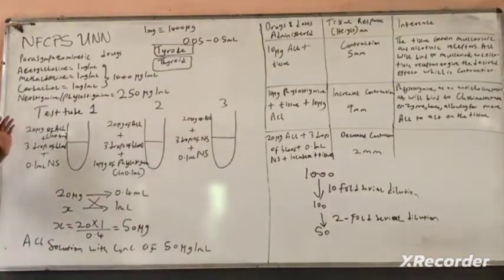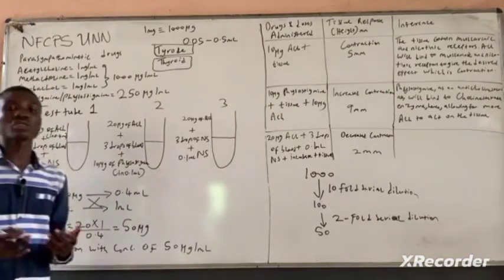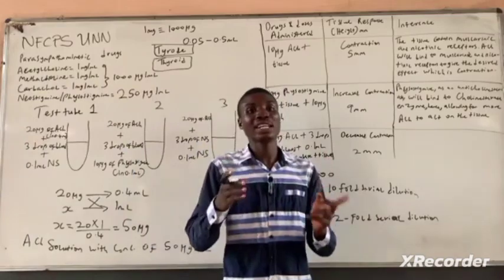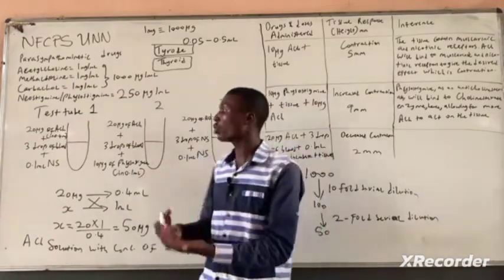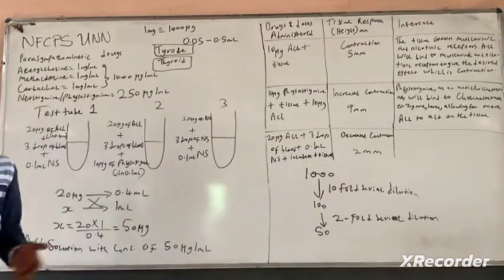So what we have here is 20 microgram of ACH in 0.4 ml of the solution, plus 3 drops of blood. The question you want to ask yourself is, what is blood doing here? Blood is doing a very simple job. Blood contains cholinesterase enzymes, so addition of blood is simply as good as adding cholinesterase enzymes. And that's exactly why you're having blood in this particular test.